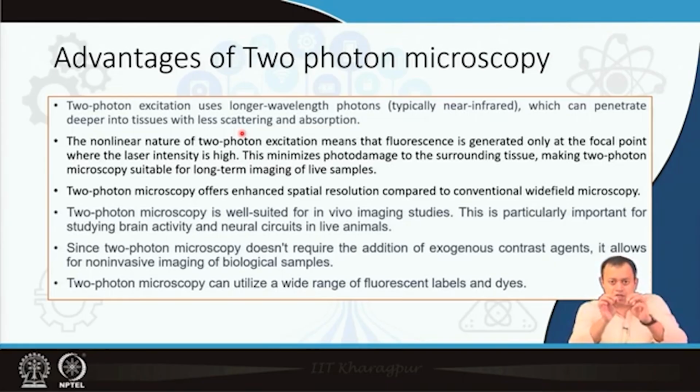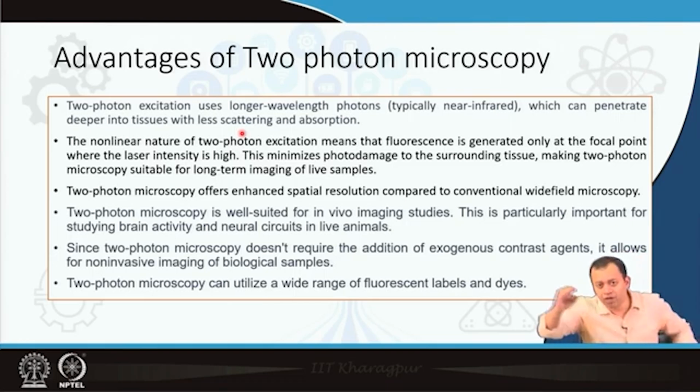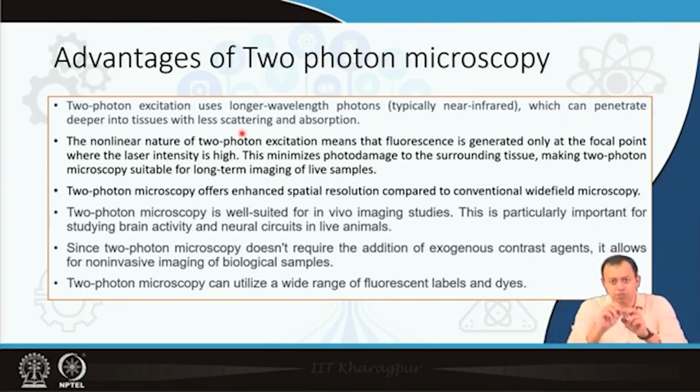The brain is not absorbing it, but the fluorophore which is tagged with a specific area, specific molecule of the brain is absorbing it and is then emitting the light. So, you can thereby see a certain portion of the brain, and you by this time know that this light is coming from only the calcium ions, and how the movement of the calcium ions can be mapped in real time, because this particular photon between 650 to 900 nanometer is not absorbed by brain tissue.